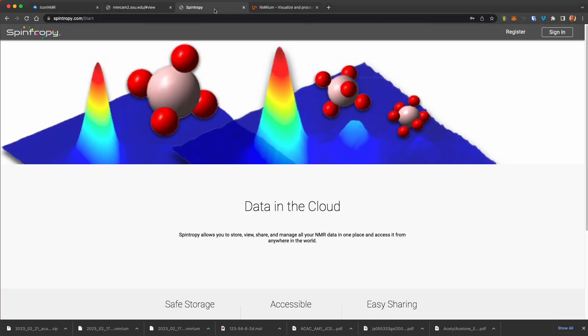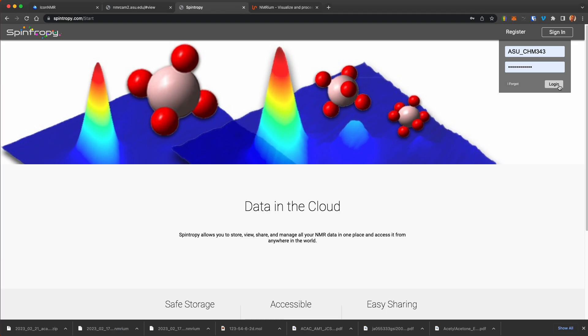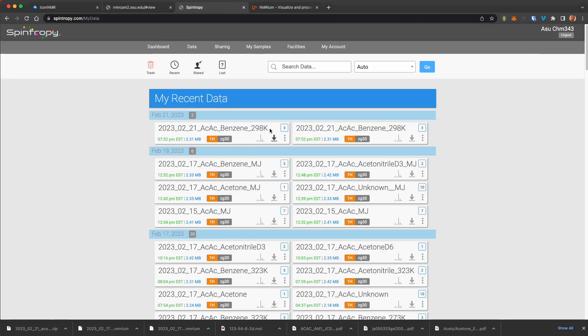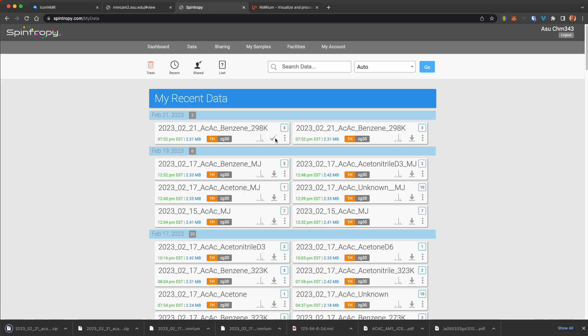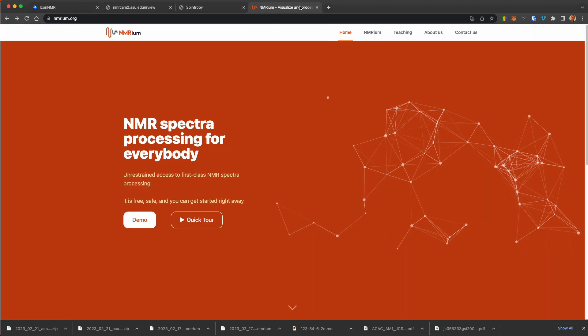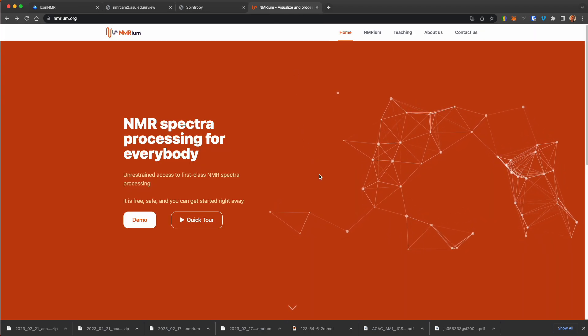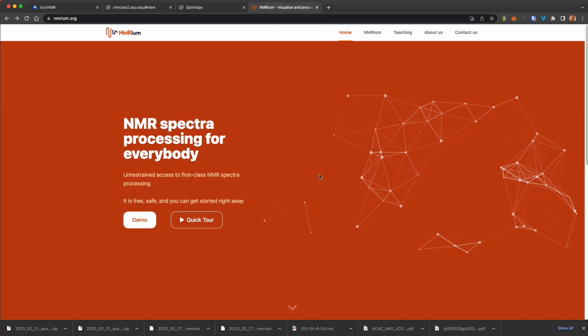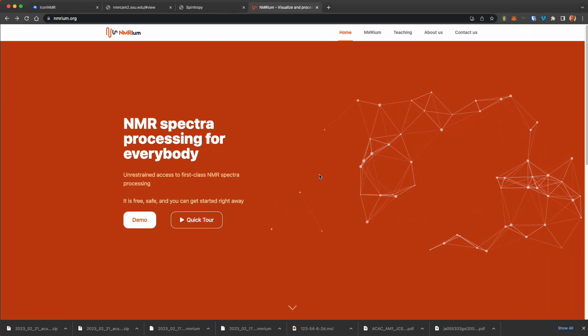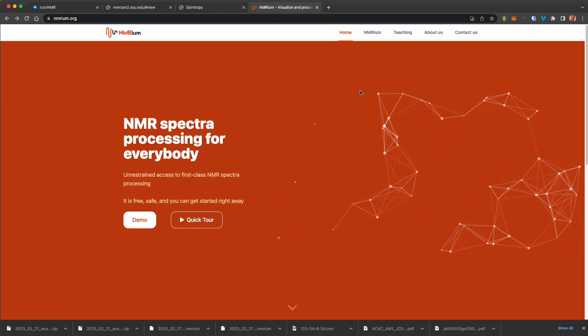This data is automatically saved to data in the cloud at spinterp.com, so we can download or view that data and download it. So download that data where any of these data sets we can download onto our own local instrument. And now, once we have this data, let's look at processing and analyzing this data.